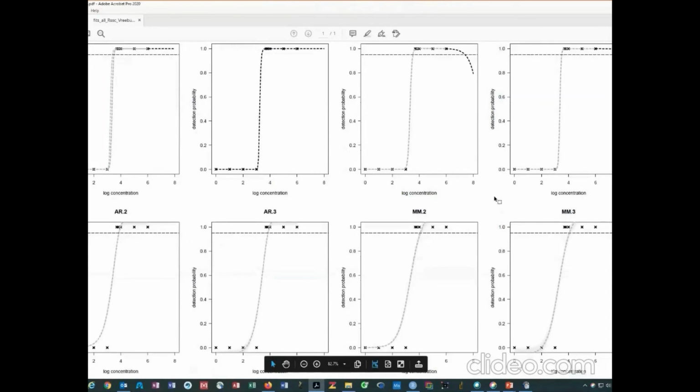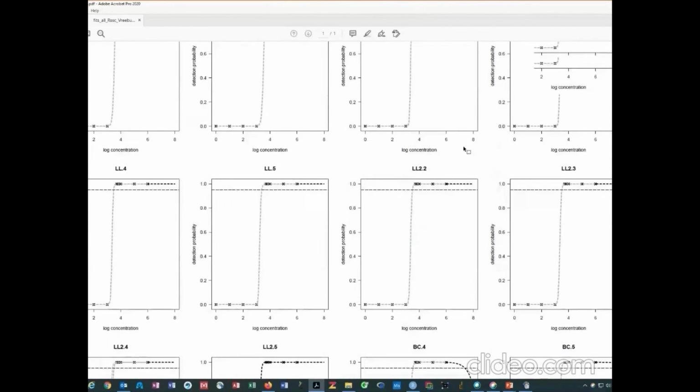Where there is a bit more residual error, you can see, for example, here, that is designated with this shaded areas. So this means that there is less fitting of the model. The fit of the model is not as good to the experimental points. So this is the first thing that we get, for all the models.